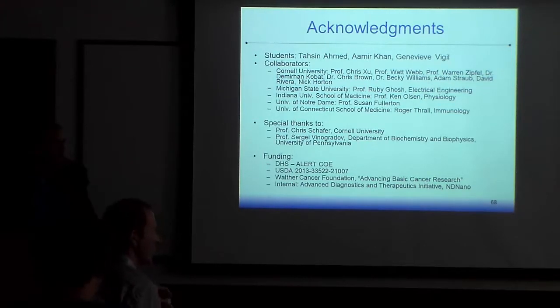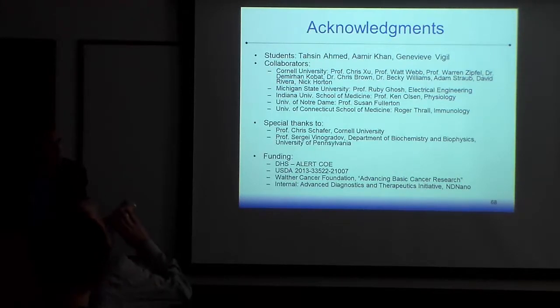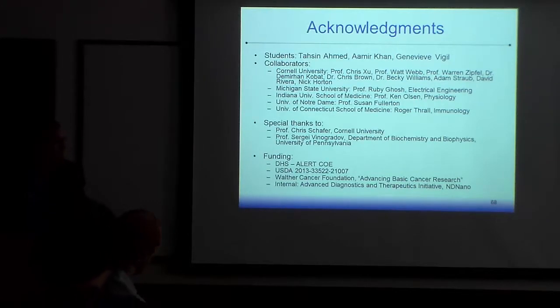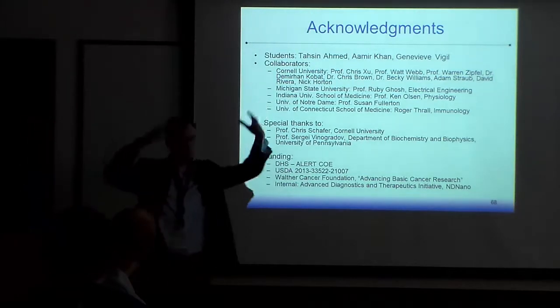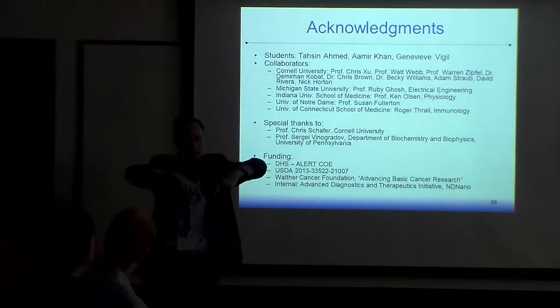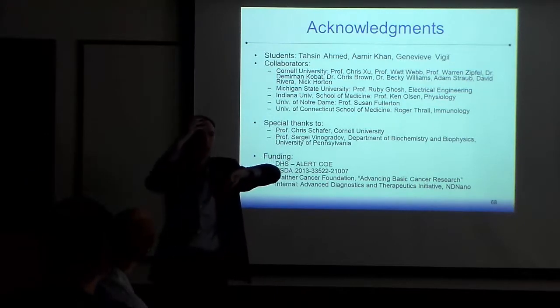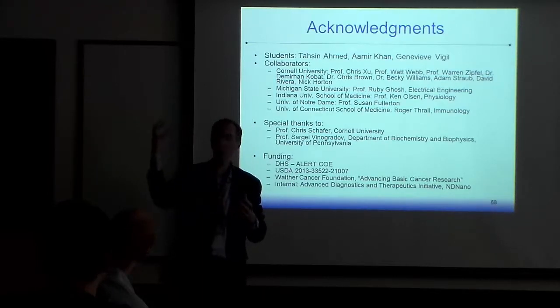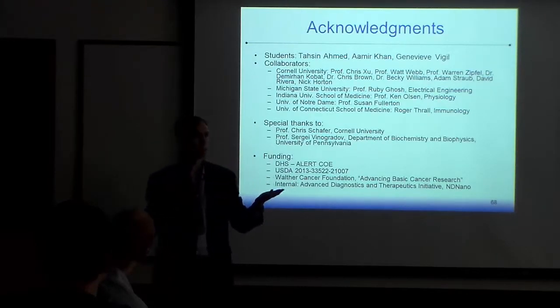It's 2 photons. Sure, okay. So this is a great question. She's asking, basically, that we're imaging with 2 photons, putting these photons in, they're exciting something, and then they're coming back. What's the probability that photons will actually come back through the same path in order to be collected by our system? Scattering is a big problem.